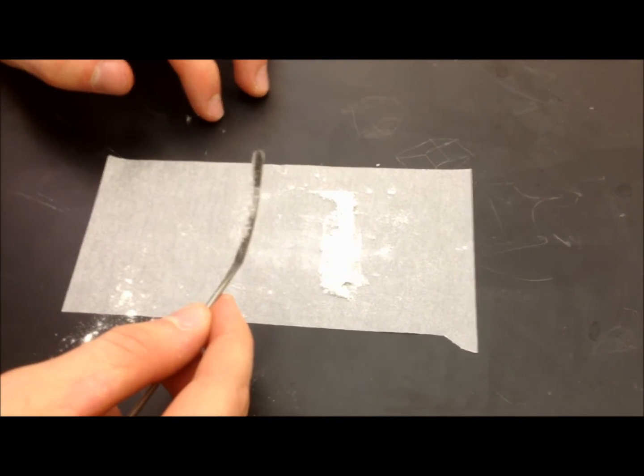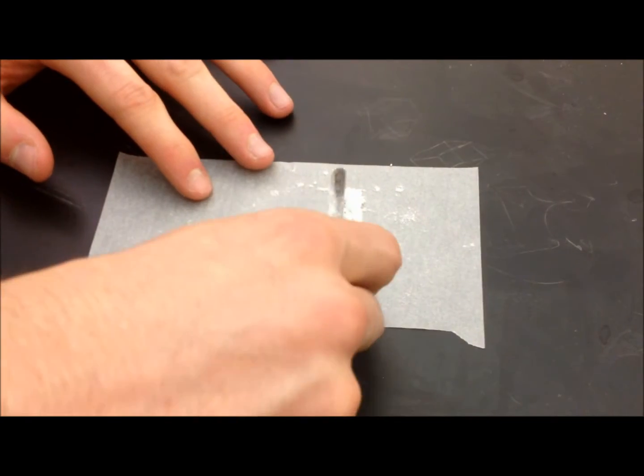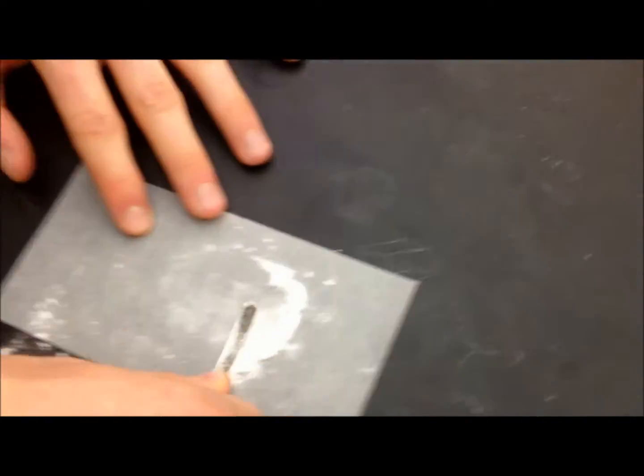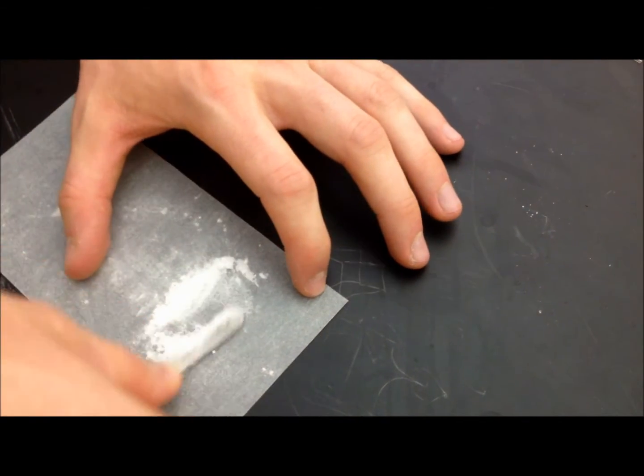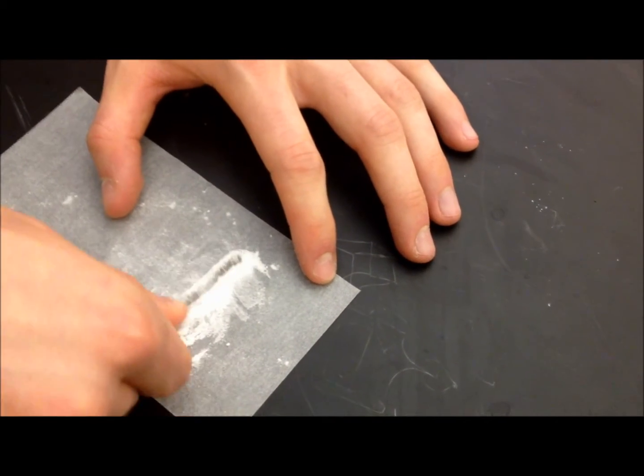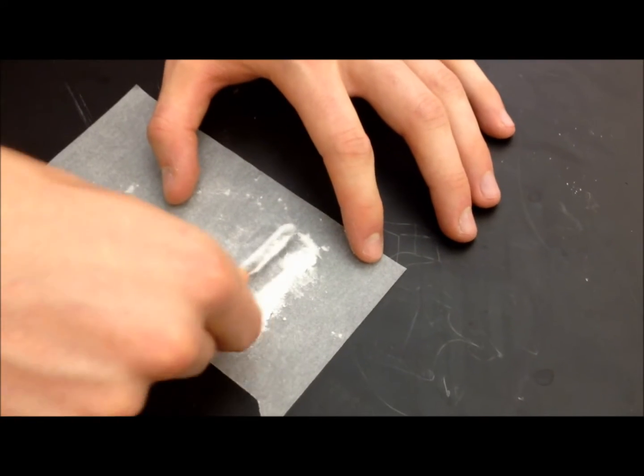The first step you need to do is pulverize your sample. The reason why you do this is to make sure that there's no solvent trapped in between your sample, and that would give you inaccurate results as you're melting your sample by forming bubbles in the capillary tube.